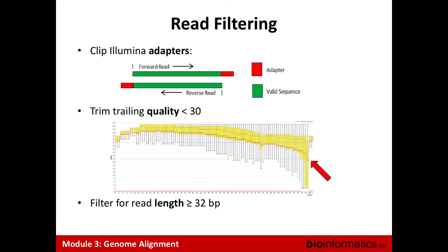What is important when we do trimming is the order in which we do that. You need to first remove adapters and then trim for quality. With some software, it depends how you pass arguments, the order in which they will work.